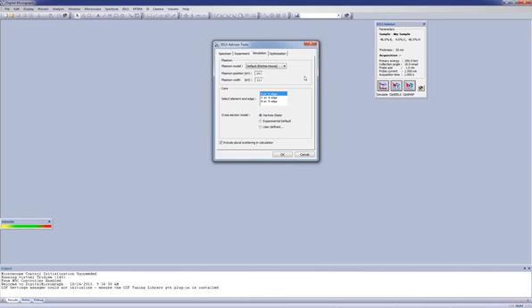But we do allow the user to play with these parameters to see if they can refine it for their particular sample. We have a default model for the plasmon. We have a plasmon position and width, but it's an editable field. So it's possible to adjust these parameters to try to come up with a better model for the system.